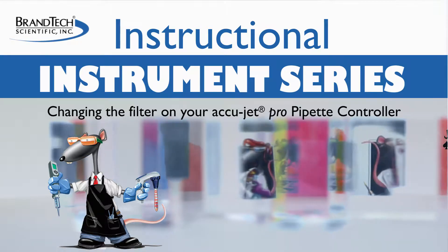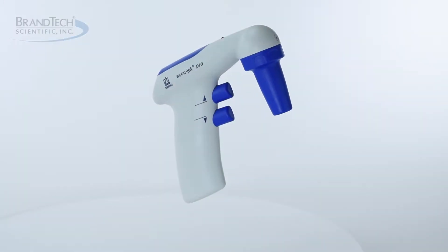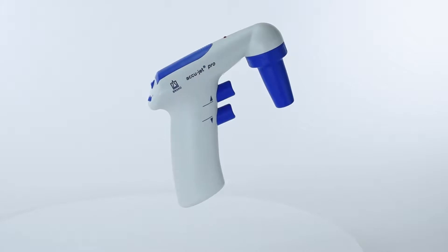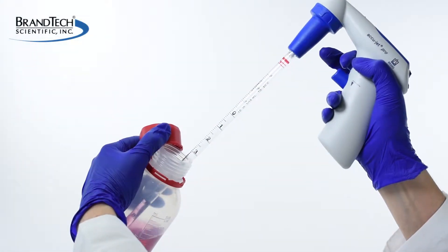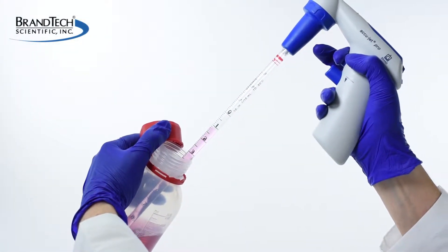How to change a filter on your Brond AccuJet Pro or AccuJet motorized pipette controller. Brond AccuJet Pro and older AccuJet models feature smooth pressure-sensitive speed control.